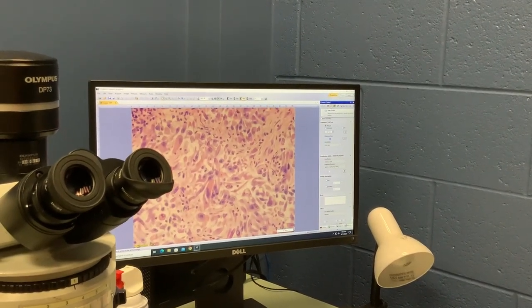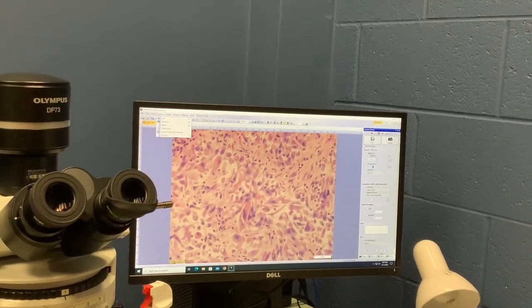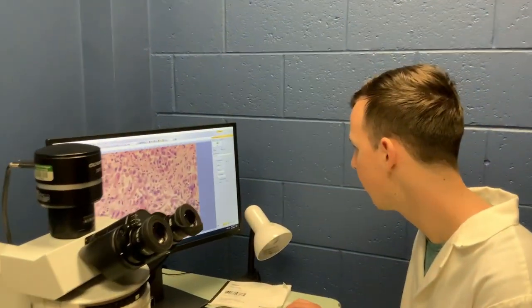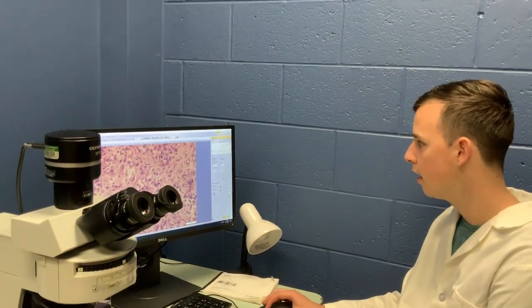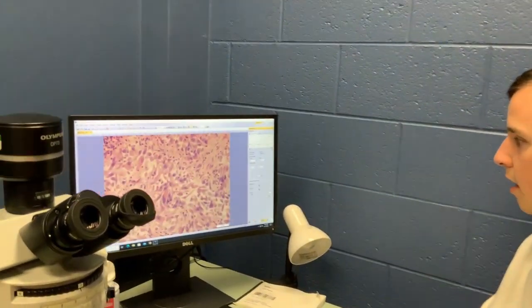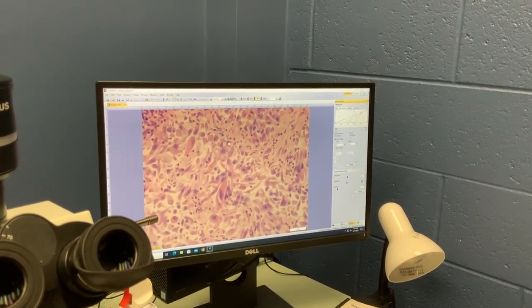That takes us through most of our controls here — it's pretty simple. There are other tools in here if you want to measure or process the image in another way, but mostly it's just a fairly simple bright field microscope that takes nice color pictures. There's also the option in this Process Manager to take a recording of bright field if you needed something in color that was a recording. There are some adjustments you can make to brightness and contrast, noting that all of these changes should be applied evenly to different images because you're changing the image you've taken.